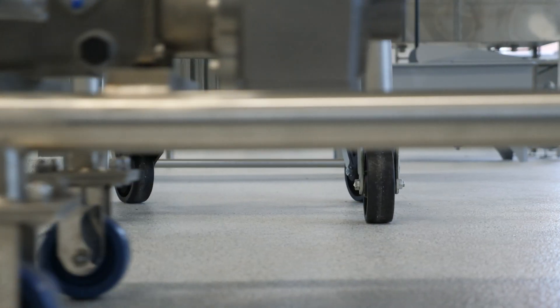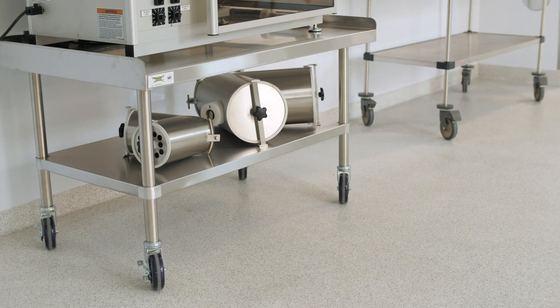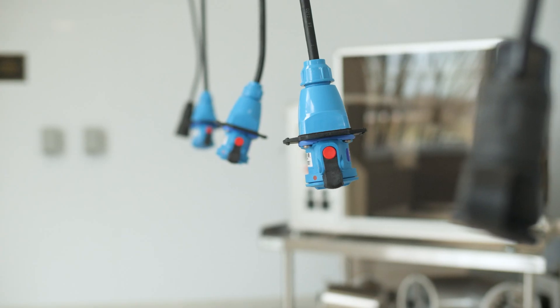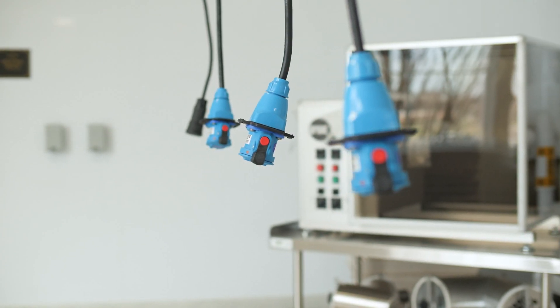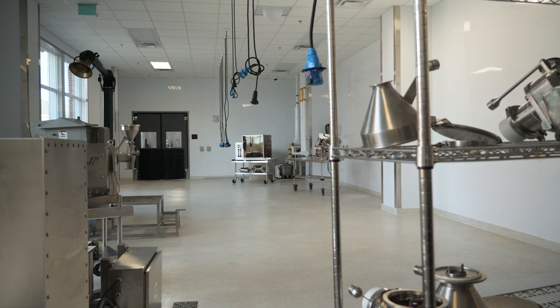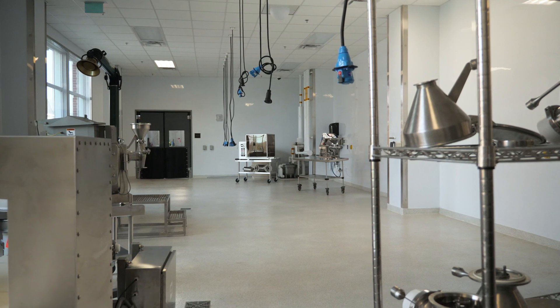We've put equipment on wheels so we can move things out of the way when we don't need them on a given day, and also bring new things in. The electrical drops are plugged into a fuse bar above our head — we can plug new fuses in and drop new voltage lines if needed. We have water lines above our head as well, so we can tap into them and bring new water lines down to our equipment.